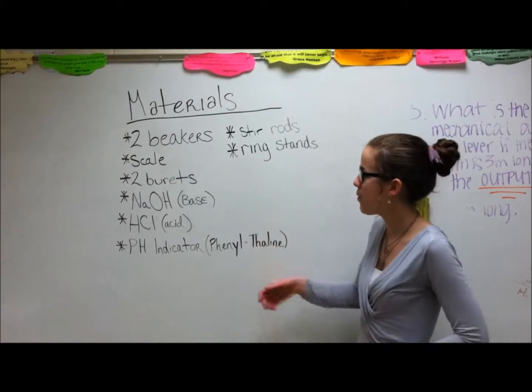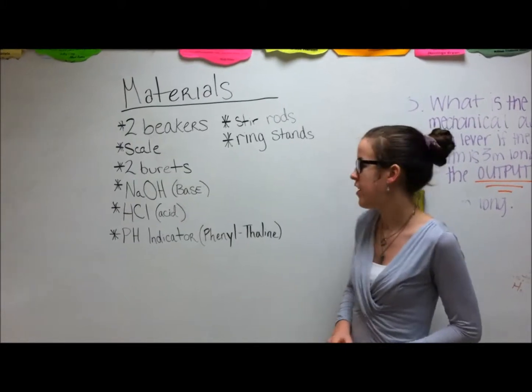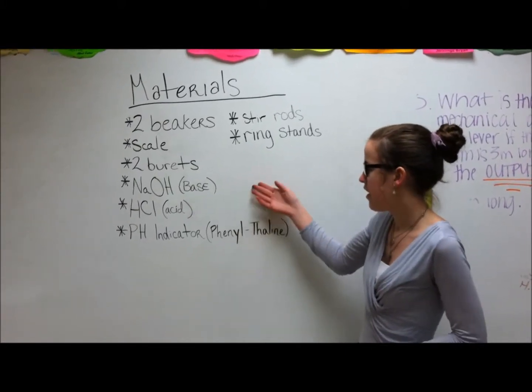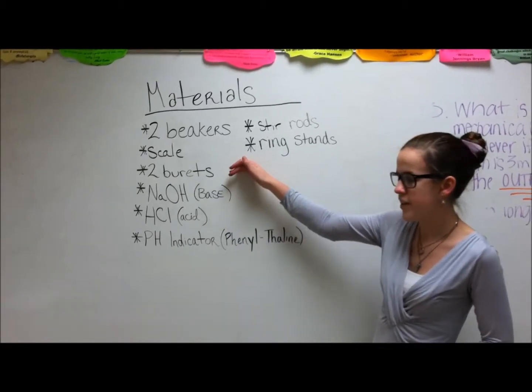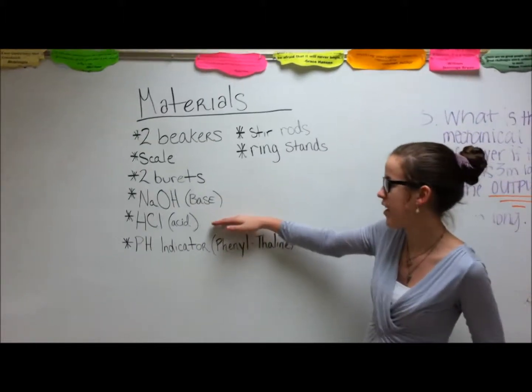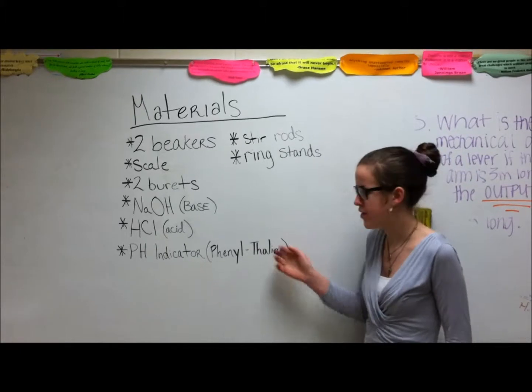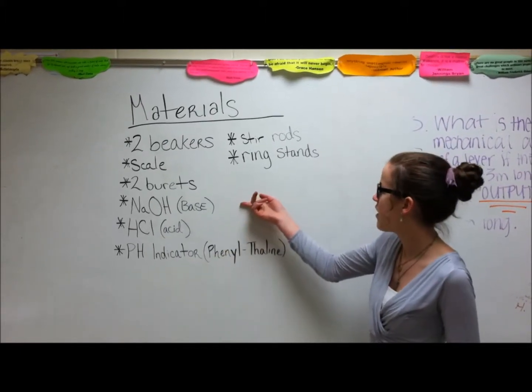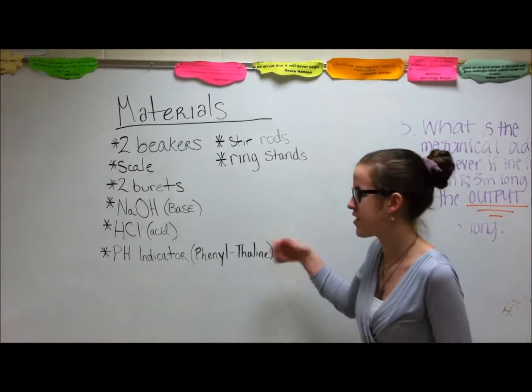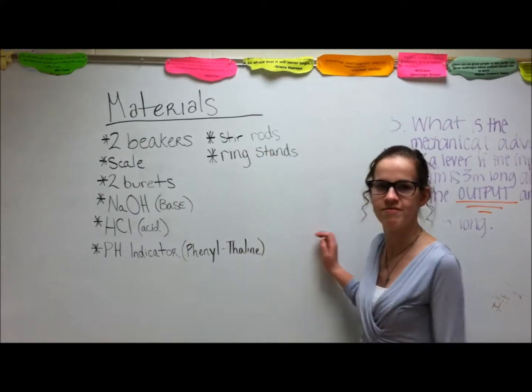Materials we'll need for the lab. We'll need 2 beakers, and then the scale for measuring the sodium hydroxide pellets. The 2 burettes, one to hold the sodium hydroxide and the other to hold the hydrochloric acid. The pH indicator, we're going to put a few drops into the acid as we add the base. And the stir rods, to stir it as the base is being added. And the ring stands to hold the whole contraption.